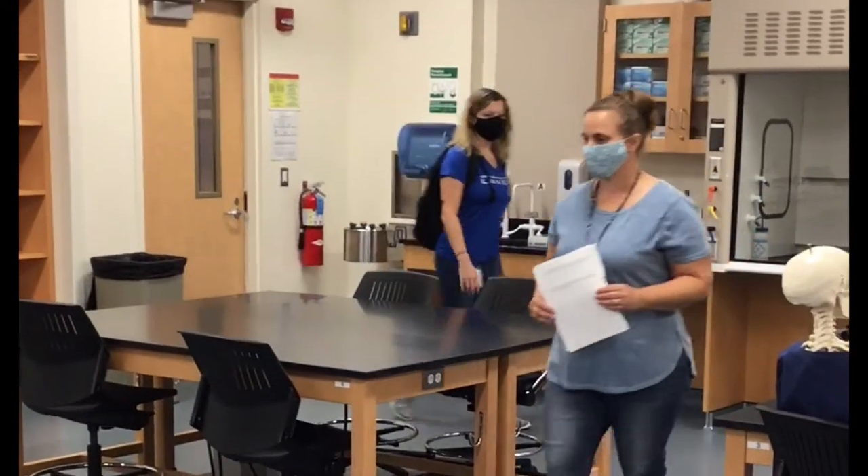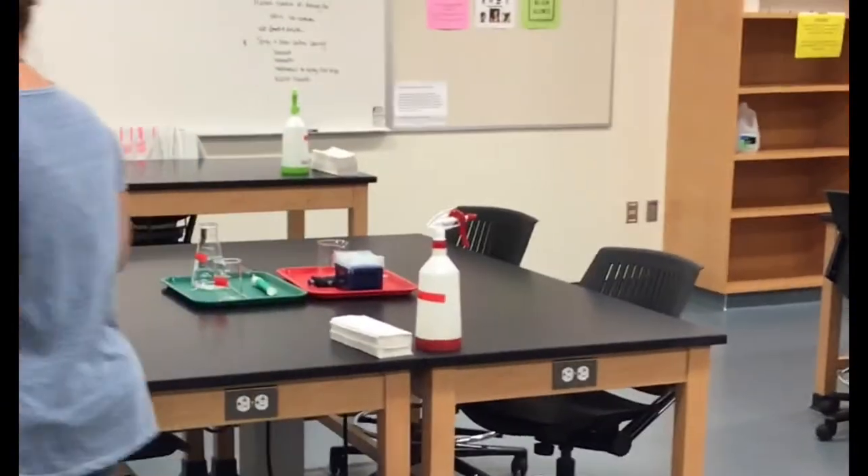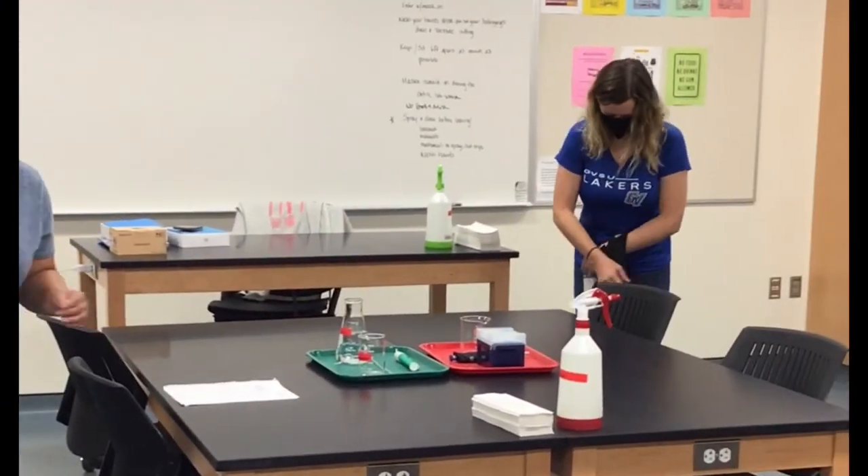When you enter the lab, make sure your mask is on and you're maintaining six feet of distance between other people. Before you begin the lab, you'll want to set down any belongings at your table that you will need for the lab.